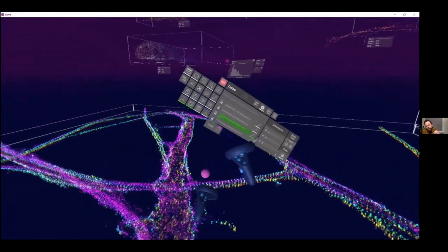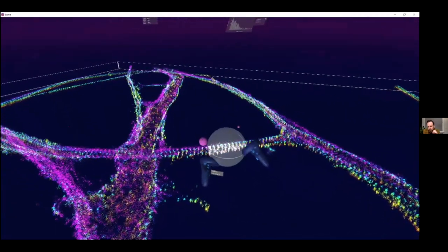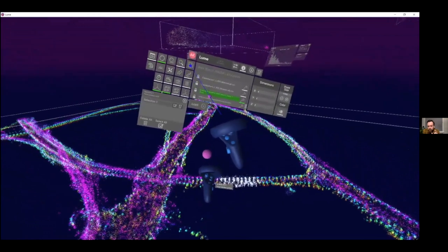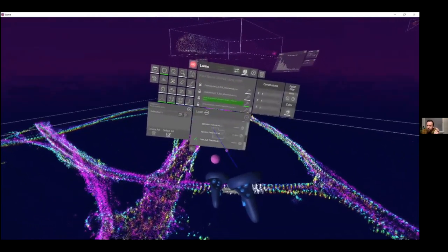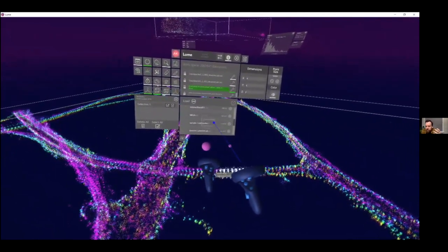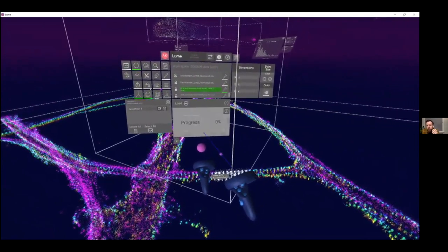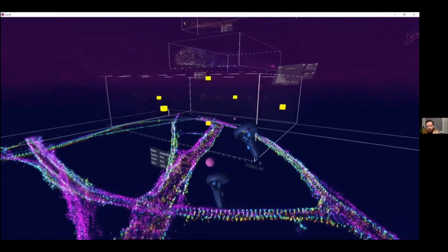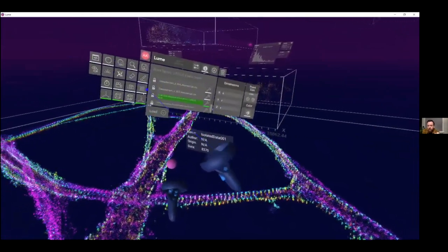To break the diffraction limit and do super resolution imaging, the trick one has to play to avoid violating the uncertainty principle is to trade off spatial information for temporal information. So what you're doing here is that it takes a while to acquire these images, typically on the order of minutes to hours. So what we're not doing here is seeing a live reproduction of living cells. That's certainly something we'd love to do, and we are working towards.